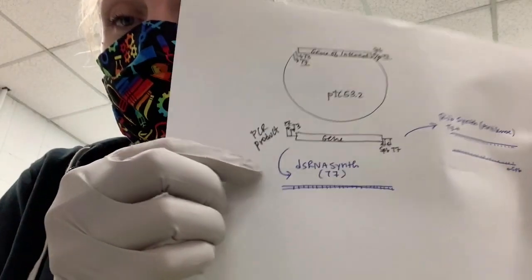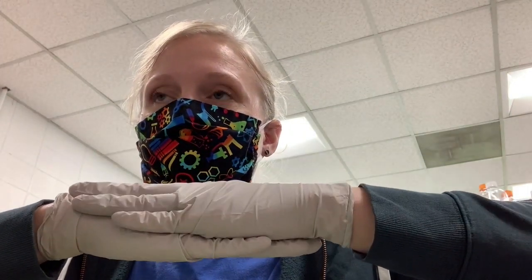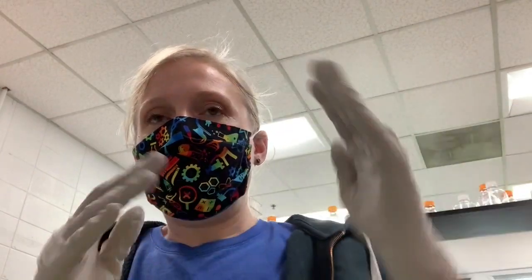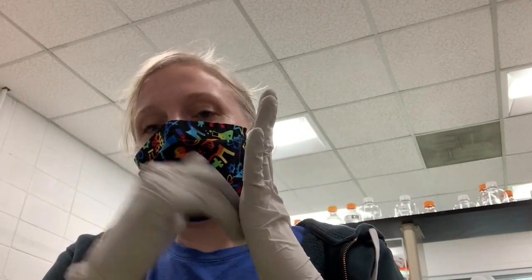RNA from both strands of the PCR product like this, that doesn't mean that all of that double-stranded RNA is perfectly paired with its antisense strand. You could have bits of RNA that are paired with more than one strand of RNA and things like that. And so what this annealing process will do is you will heat your samples up to 95, which will melt all of those complexes apart.